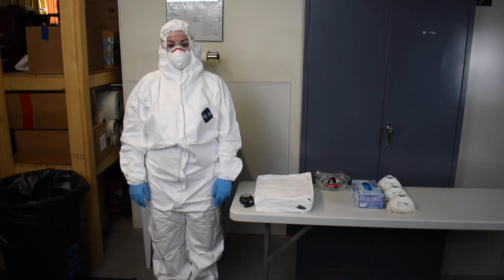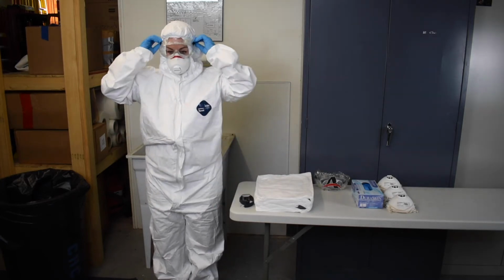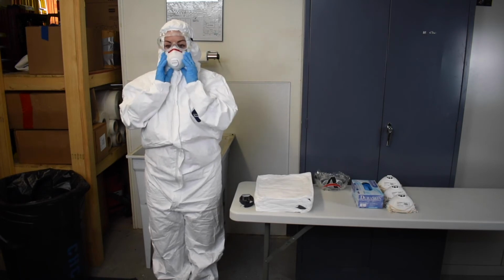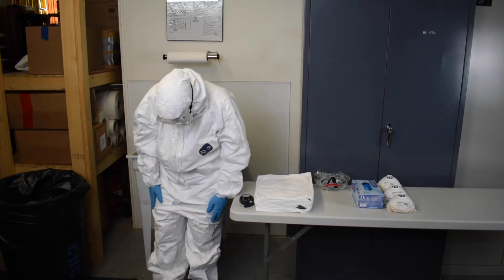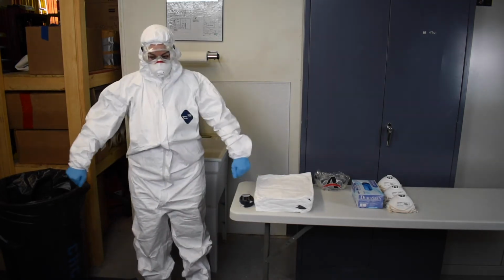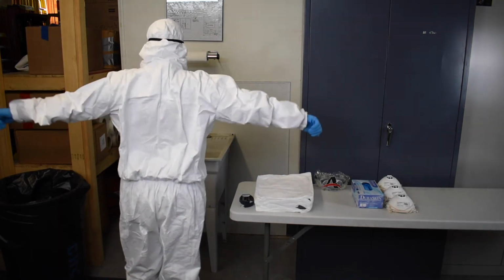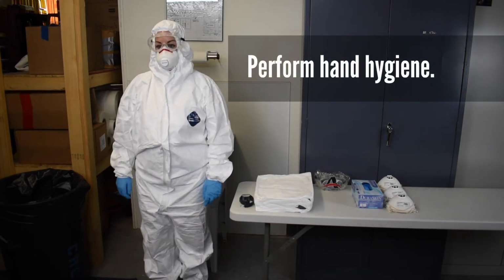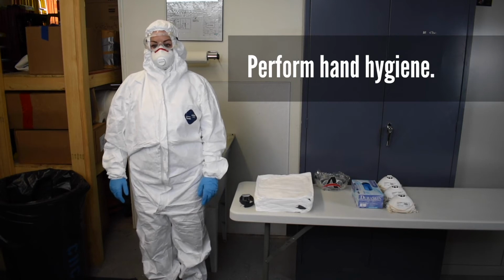Now inspect the PPE. No exposed hair or skin should be visible at the end of the process. The healthcare workers should remain comfortable and able to move without restriction, while all parts of the body remain covered. Lastly, perform hand hygiene prior to entering the patient area.